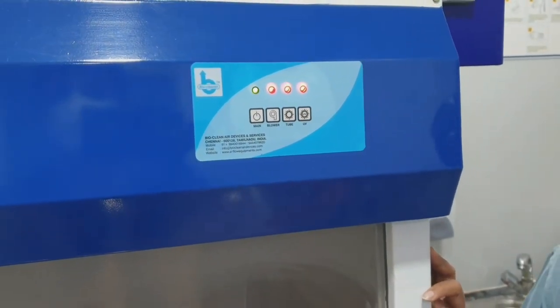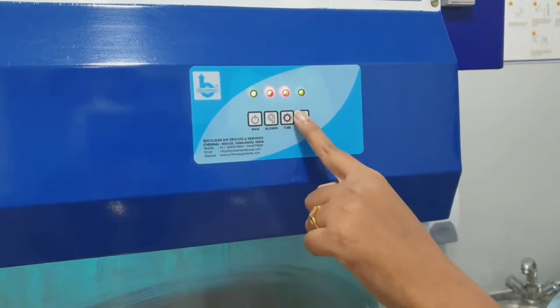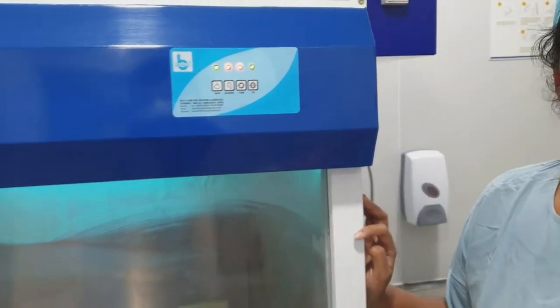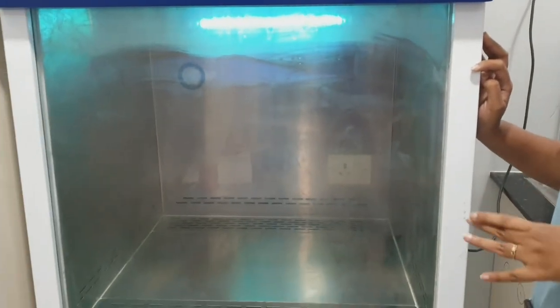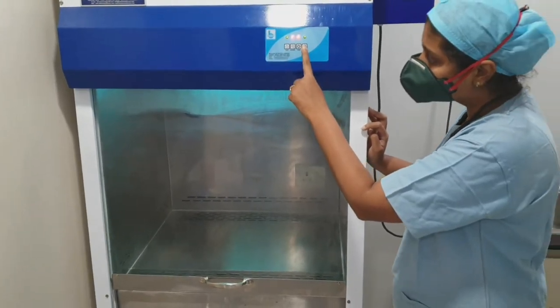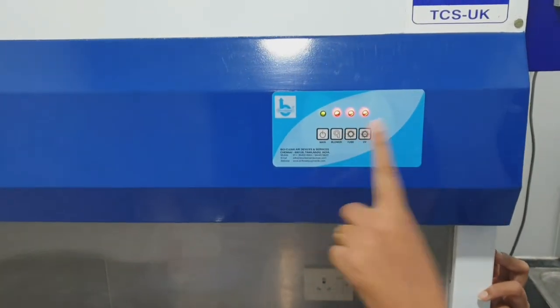When the person is not working nearby or when it is closed, you can turn on the UV light. UV light should be kept on at all times when the personnel is not working here. But when the personnel is coming here to work, then you have to turn off the UV light, turn on the blower, and turn on the tube light.